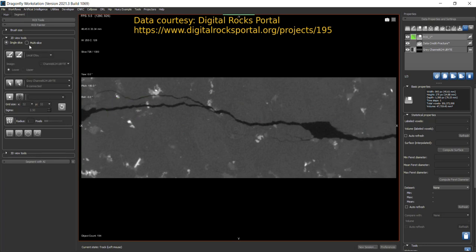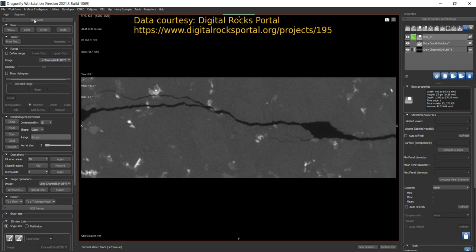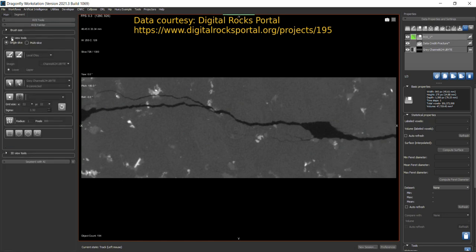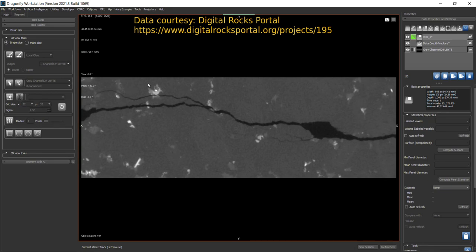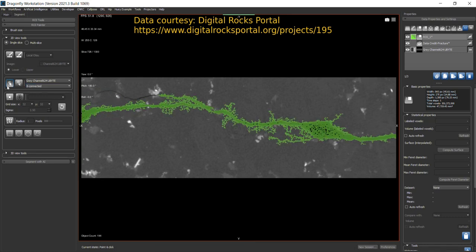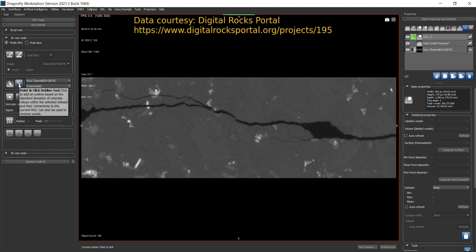If you want to completely remove a painted region, go to ROI Tools and click Clear. Now, the Point and Click Tool also adds pixels to the ROI, but it's based on the standard deviation of intensity values within the selected data set and on connectivity. Make sure to hold down the left Control key when using it.